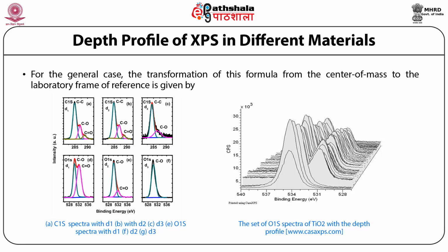The objective of the experiment is to observe the trend in the elemental quantification values as a function of etch time. The actual depth for each XPS analysis is dependent on the etch rate of the material being etched by the ion gun at any given depth. For example, the data in figure 5 derives from a multi-layer sample consisting of alternating layers of silicon oxide and titanium oxide on top of a silicon substrate.